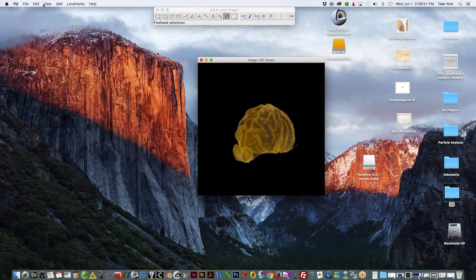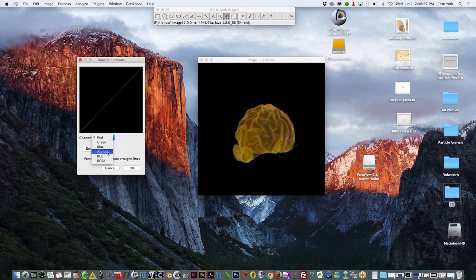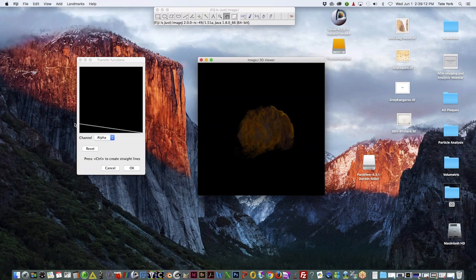So just like the block face images, we get a view over here of the coronal plane, sagittal, and horizontal. And just like the block face, we can go in coronally. This is the plane that it was sectioned in. You will notice a difference in staining intensity. I performed an intensity normalization across the stack, and it did a pretty good job. But as you can see over here, there's still a few differences in intensity. Not so much that it's taking away from the myelin stain.